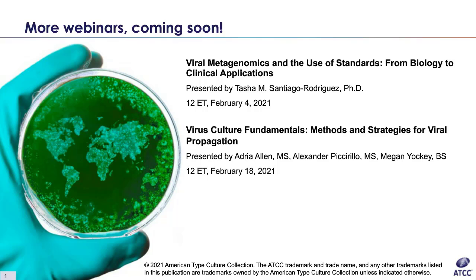Yeah, I would recommend trying to find any sort of documentation that would have come with the liquid nitrogen tank you have. And if not there, probably try talking to whoever provides your liquid nitrogen to see if they've seen a similar tank and how many gallons they would use to fill that tank. Okay. Good answer.